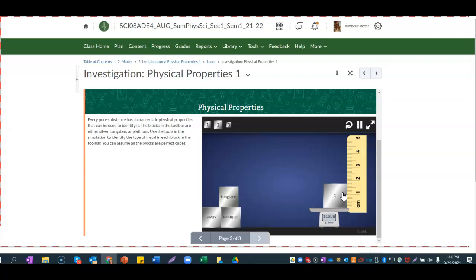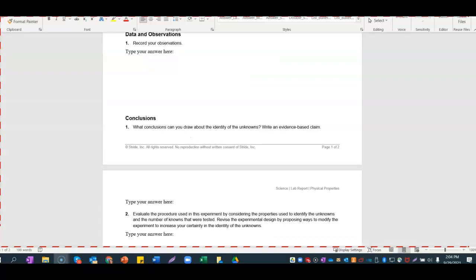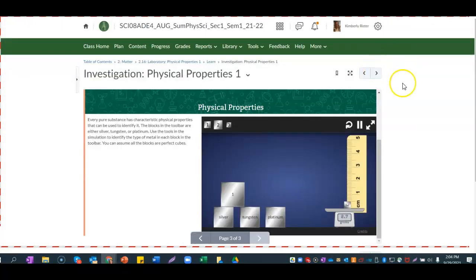So we've got, let's see, 112.6 is the mass. And then luckily, these are all in units of 10, right? So this is going to be 1 point, we know this is 5, 6, 7, 8. I think it goes to the 8. So 1.8 centimeters.